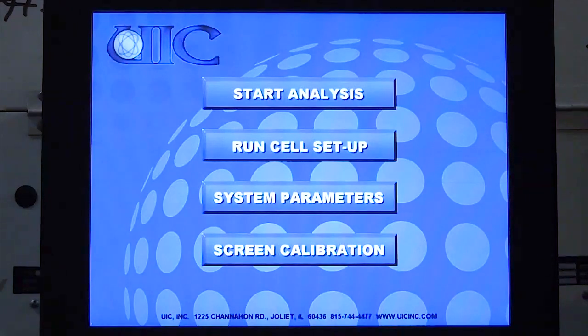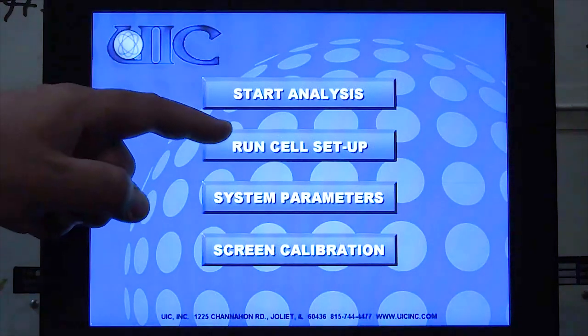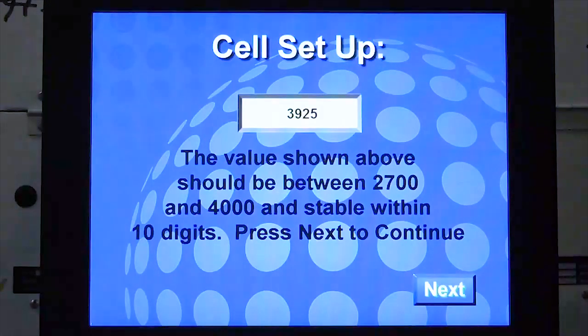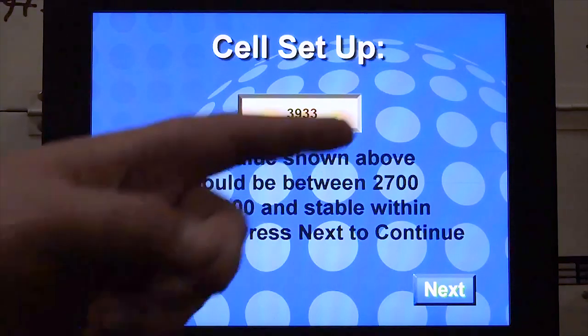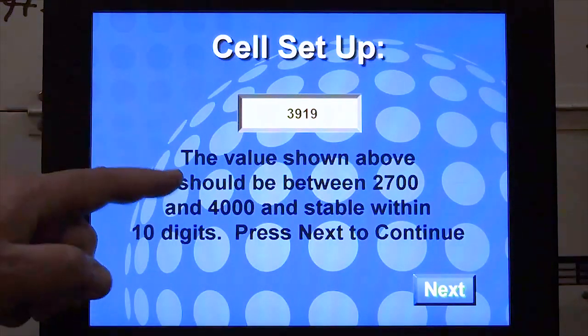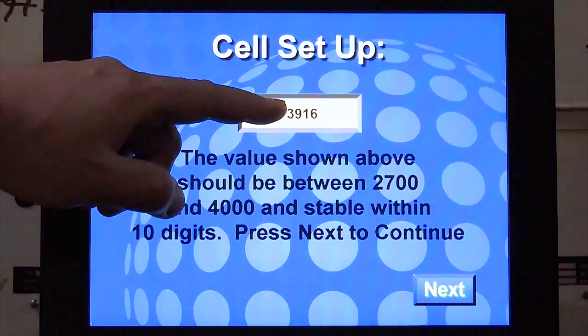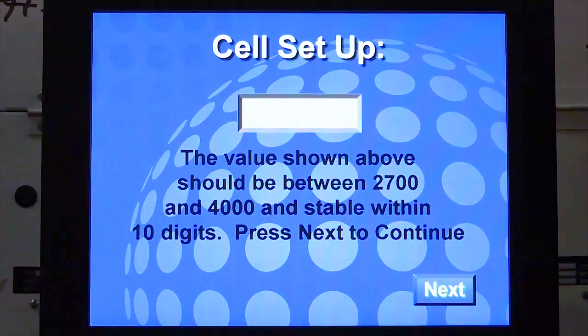When the cell is placed in the coulometer and connected, and the cell current button is still in the off position with the carrier gas going through the cell, you can go to run cell setup. The system will use this number to determine 100% transparency. You can move the cell slightly left or right to maximize this number. The number should be between 2700 and 4000 and stable within 10 digits. At this time, it is best to leave the system 5 to 10 minutes to stabilize. When the difference is less than 10 digits, press next. The system will regard the final number as 100% transparency.